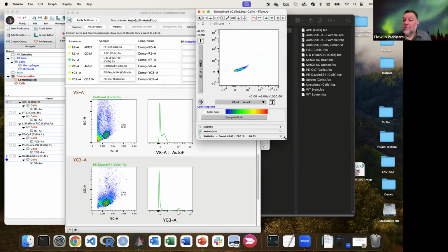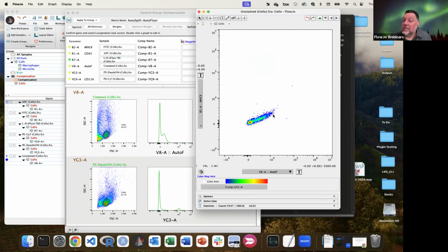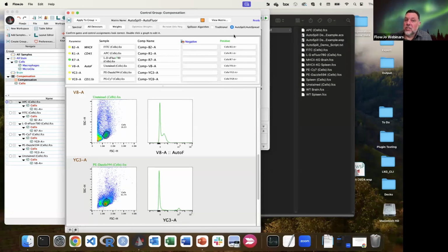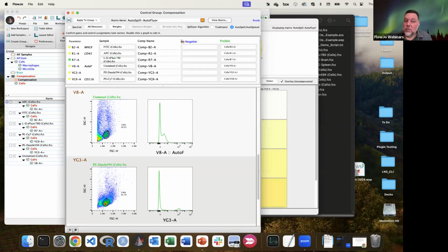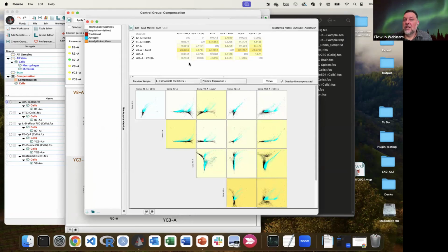There's the key point, is that you have this autofluorescent subset of events in this sample that actually will overestimate the amount of MHC2 if you don't account for it using autofluorescence subtraction. And so this is a great example of just not having to gate anything except the size gated cells. So I don't want the debris, I don't want the big stuff, I want the actual cells that are intact. And then we go ahead and calculate the matrix, and it's just doing an iterative regression analysis of each of these samples using one sample that's in tube negatives, and it's calculating the entire subset, right?